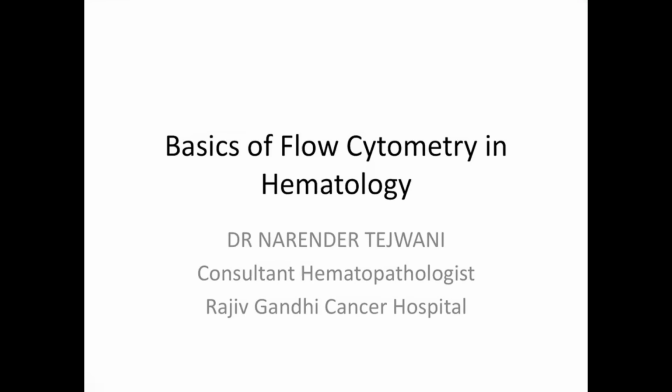We can see this name, flow cytometry, has two components. One is flow and the second is cyto. What do we mean by cyto? Cyto means the cell. So flow cytometry is, first of all, the study of cells. And when we talk about hematology, what are those cells?